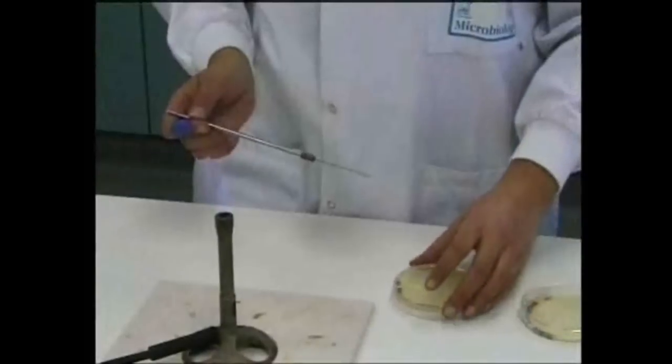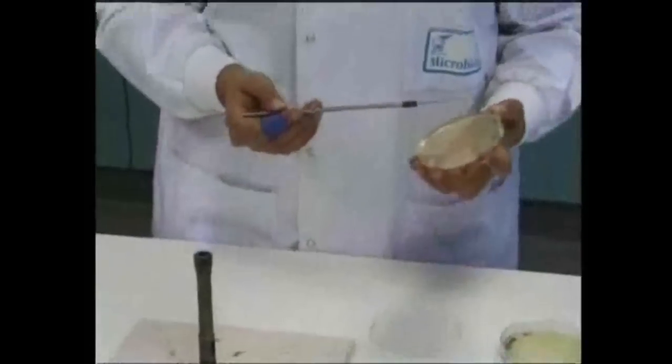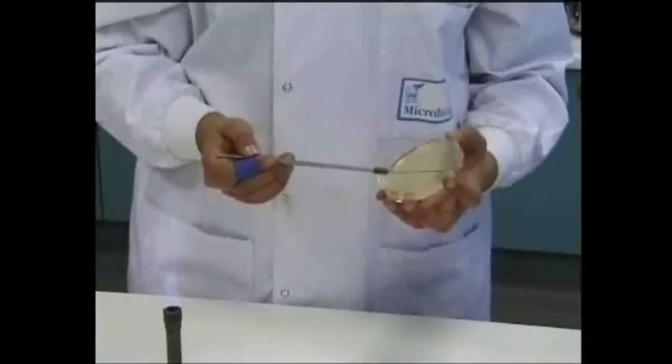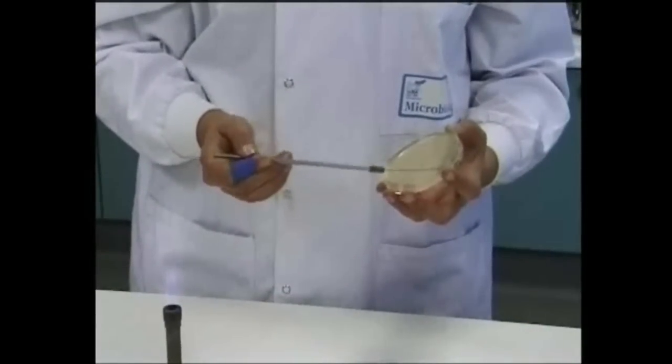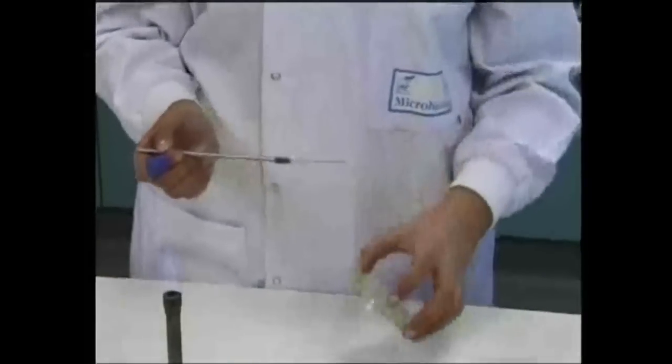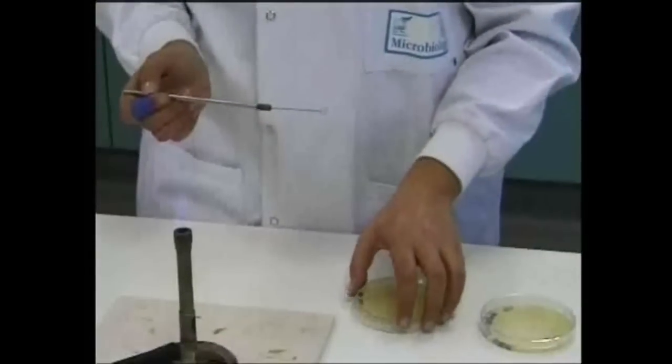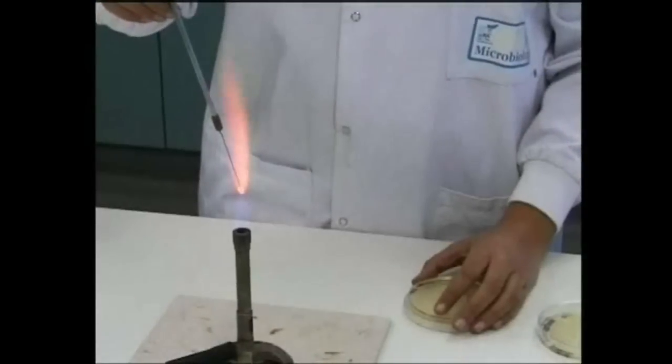It's important not to press down on the surface of the medium, as this can cause gouging and possibly unintentional growth of anaerobes below the surface of the agar. After streaking the first area of the plate, the lid should be replaced and the loop flamed and allowed to cool.